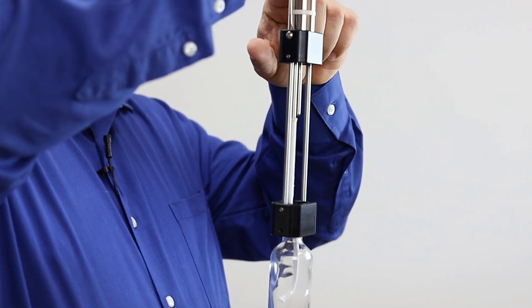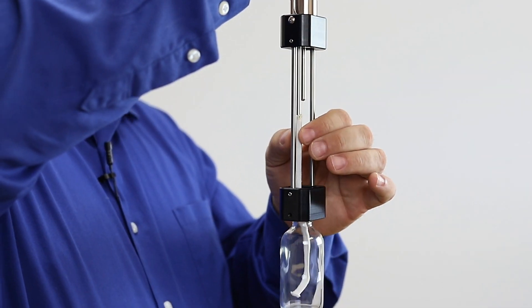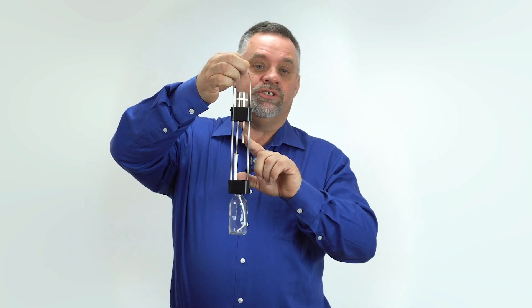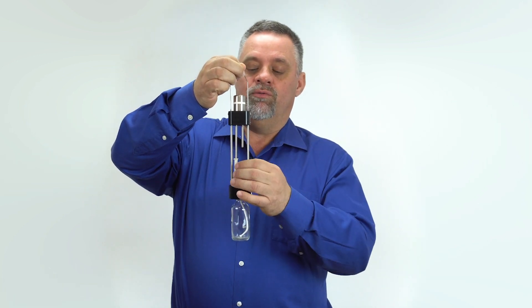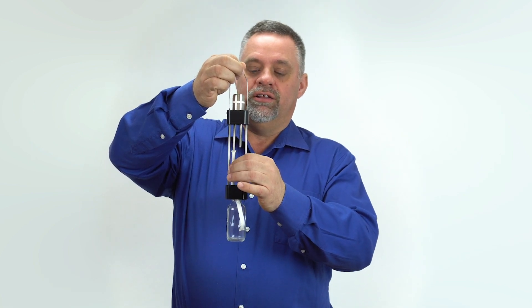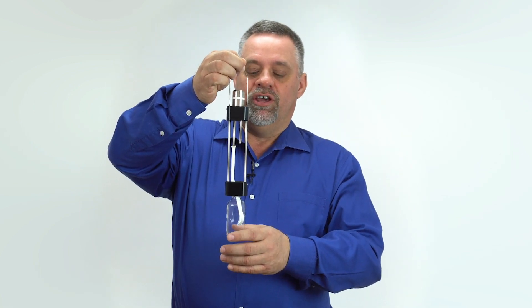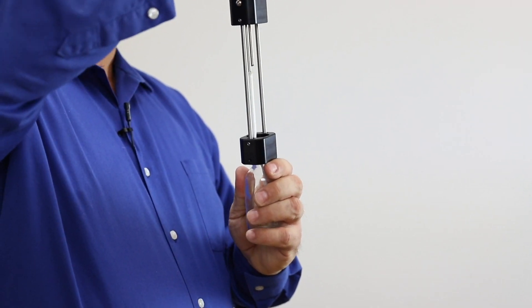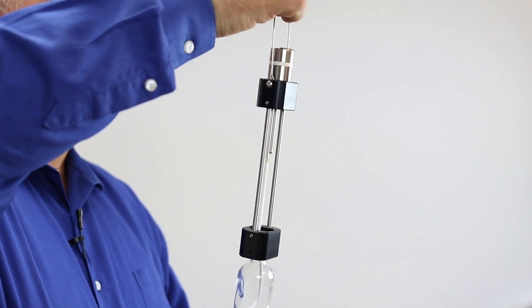It's comprised of a high temperature 140 data logger with two rigid probes — one for monitoring the ambient air temperature, which is your dry bulb, and one for monitoring the moisture wicking sock, which is your wet bulb. It also has a water reservoir and a hanging bracket so it can be hung in your smokehouse or dehydrating chamber.